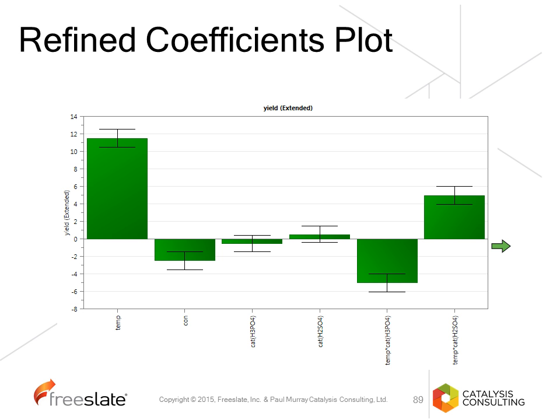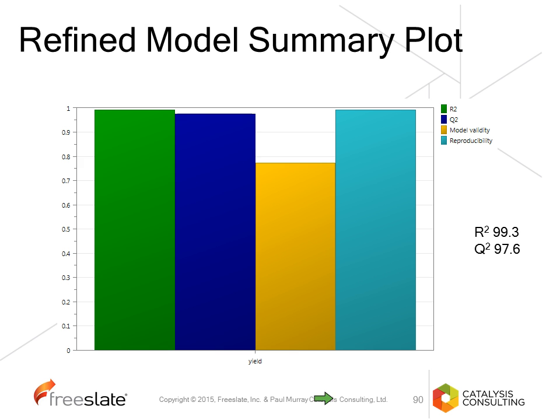But we have an interaction here between temperature and acid. So in this case we have temperature and phosphoric acid, and in this case, temperature and sulfuric acid. So what we see here is temperature, and an interaction between temperature and sulfuric acid has a positive effect. And here, concentration as well as temperature with an interaction with phosphoric acid has a negative effect on the outcome. So the model will be slightly improved and simplified.